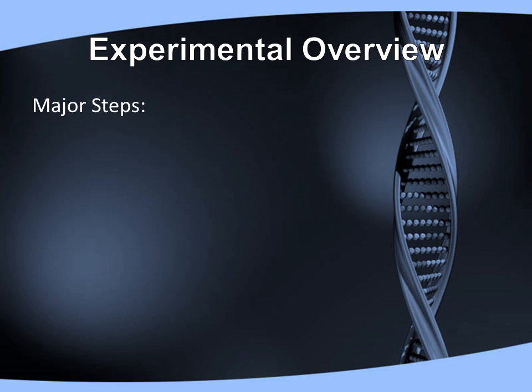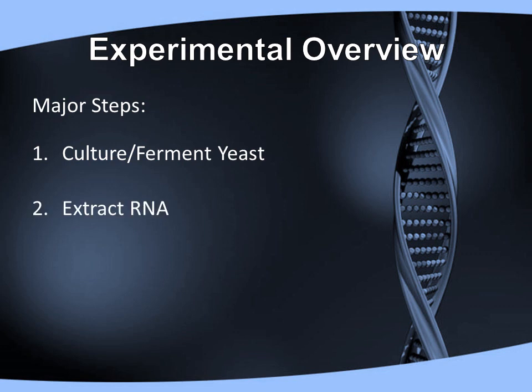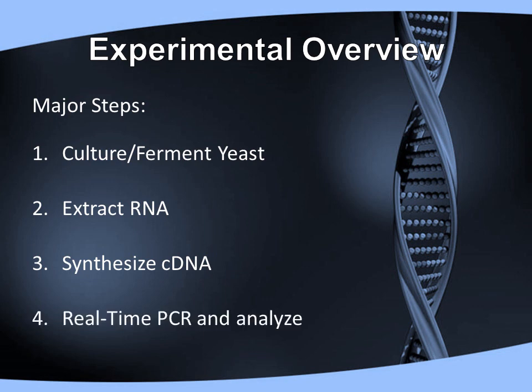Our experiment consisted of 4 major steps. First, we had to culture and ferment our yeast cells. Then, we had to extract RNA from those yeast cells. After that, we had to synthesize our cDNA from the RNA. Finally, we had to analyze our cDNA with real-time PCR.